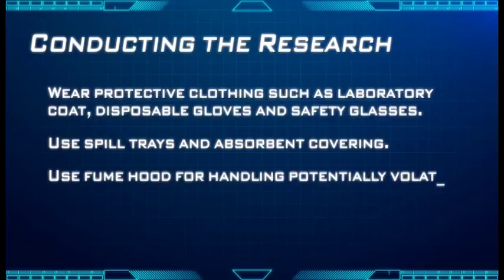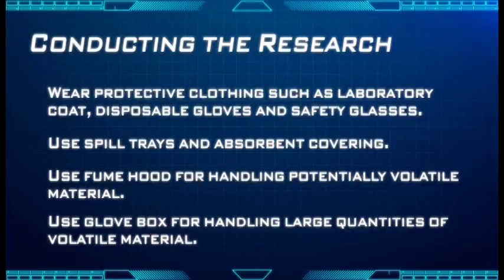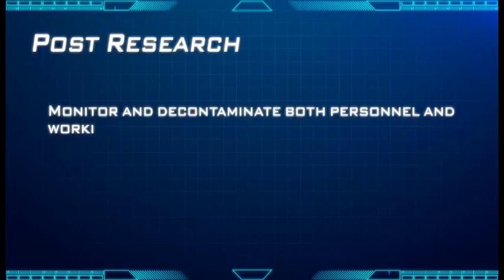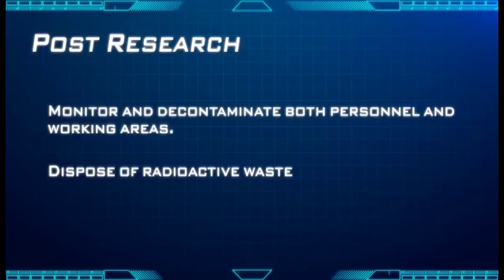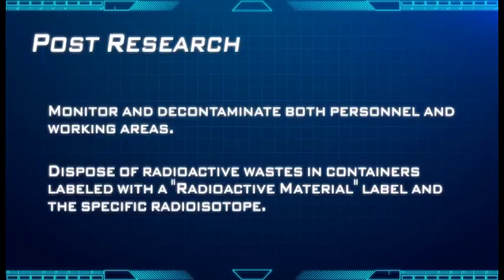Use fume hood for handling potentially volatile material. Use glove box for handling large quantities of volatile material. After the experiment, monitor and decontaminate both personnel and working areas. Dispose of radioactive wastes in containers labeled with a radioactive material label and the specific radioisotope.